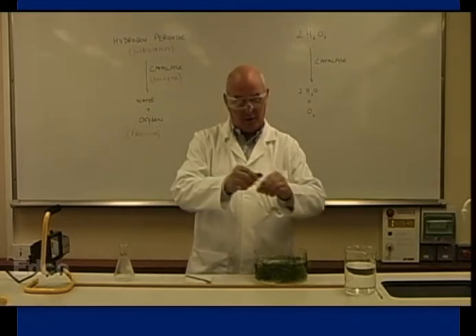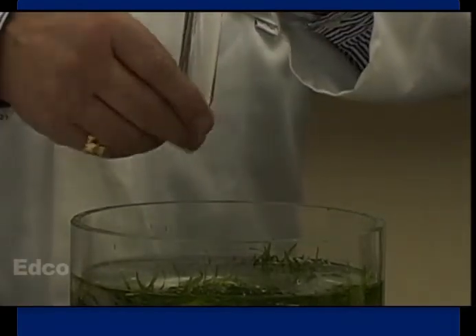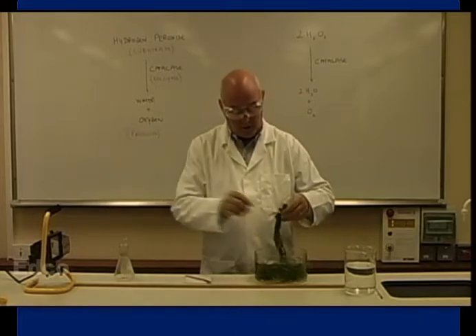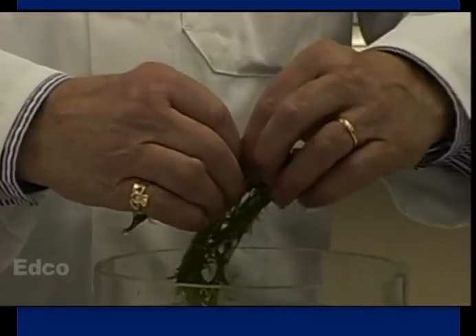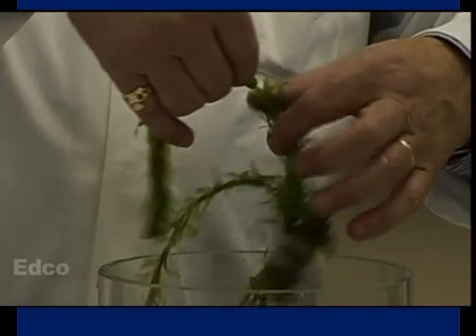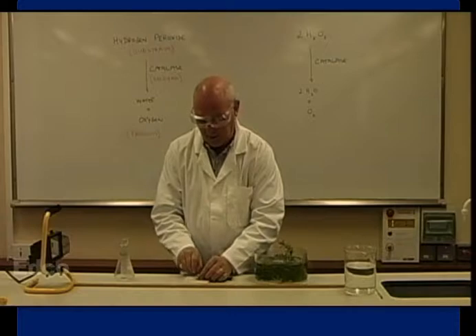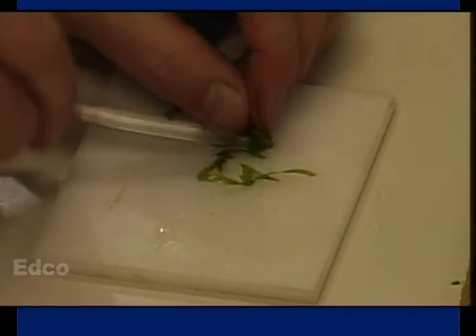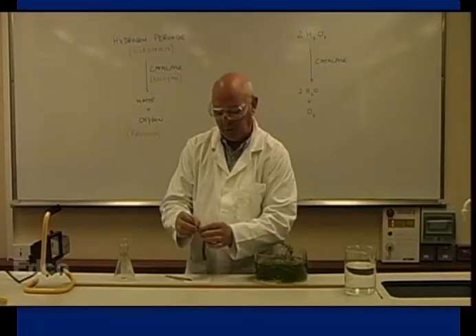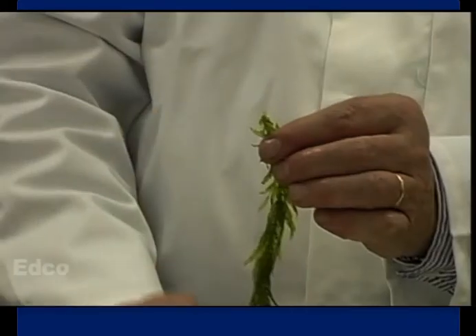First of all, we take a test tube and we take some of the pond water. Elodea wouldn't be comfortable growing in tap water, so we use pond water. And we cut a sprig of the Elodea. Cut a longer sprig than that. Now, in cutting the Elodea, we cut it at a slight angle, and that will give us a better stream of bubbles. And having cut it, we then remove some of the top leaves, just 2 or 3 of the top leaves, just for visibility, so that we can see the bubbles that emerge.